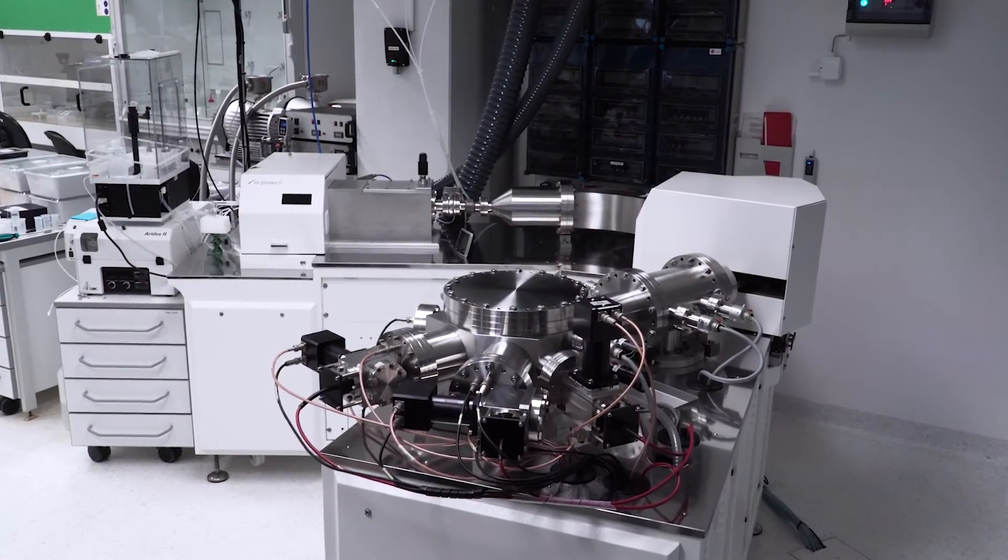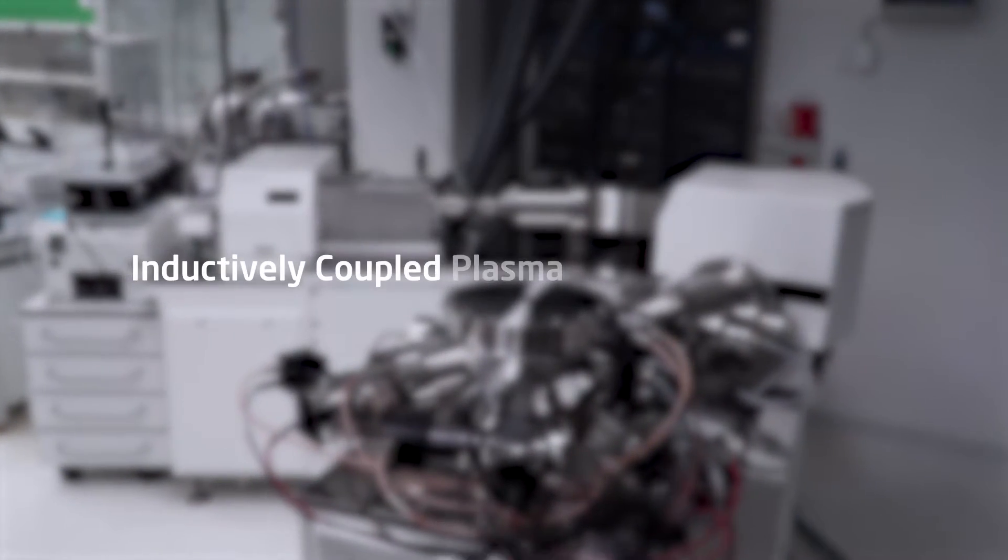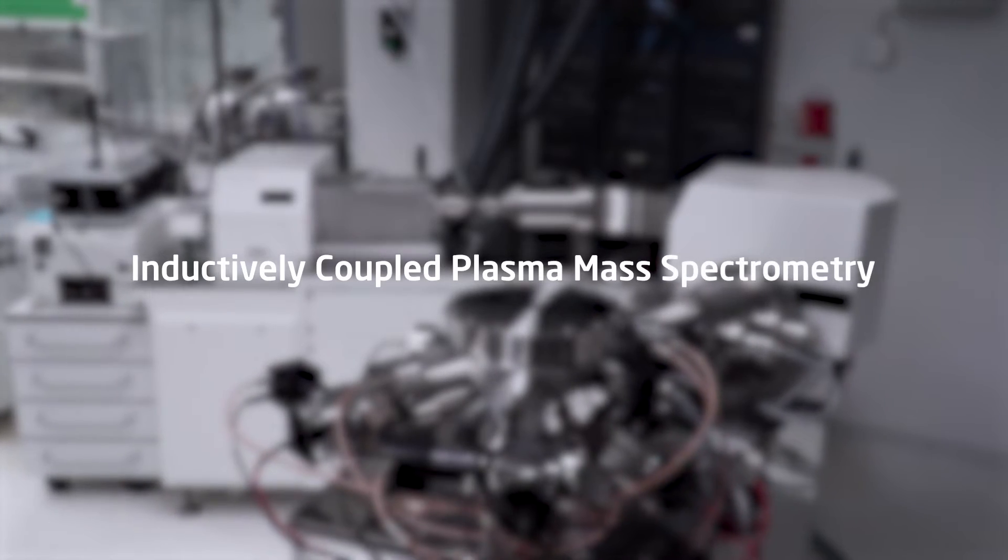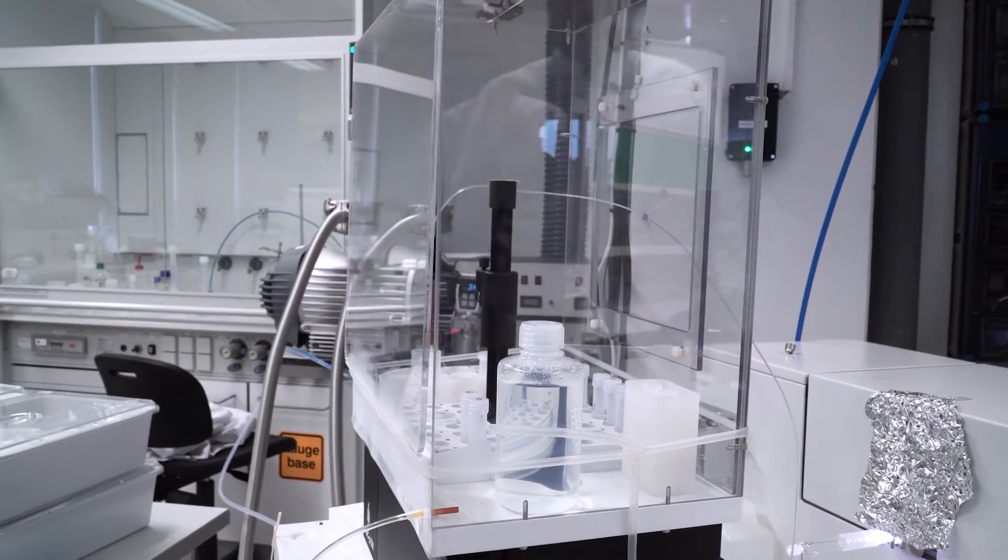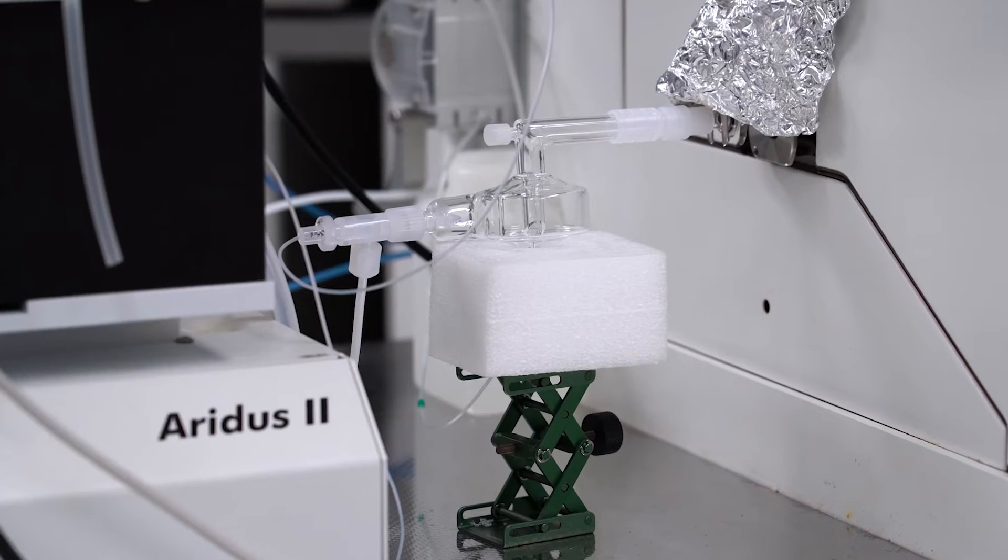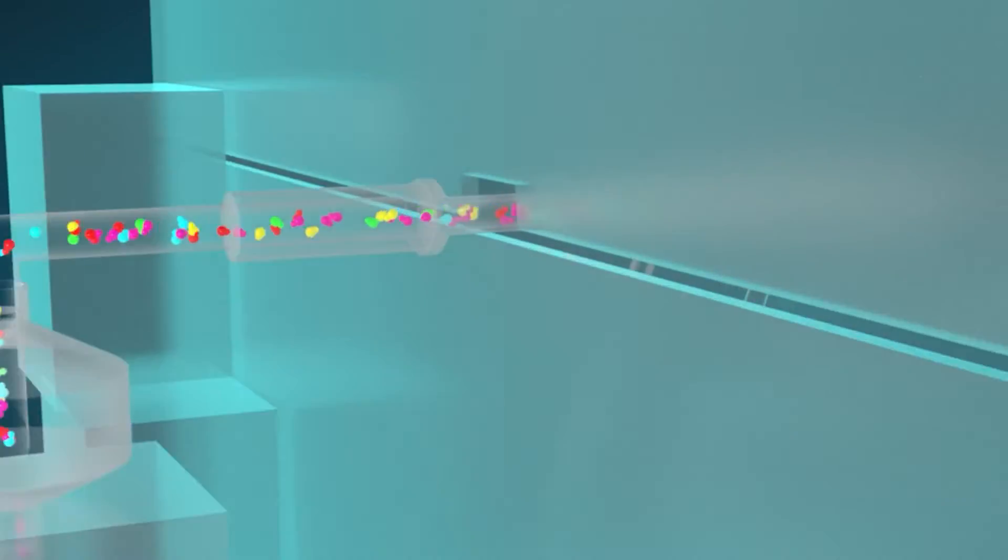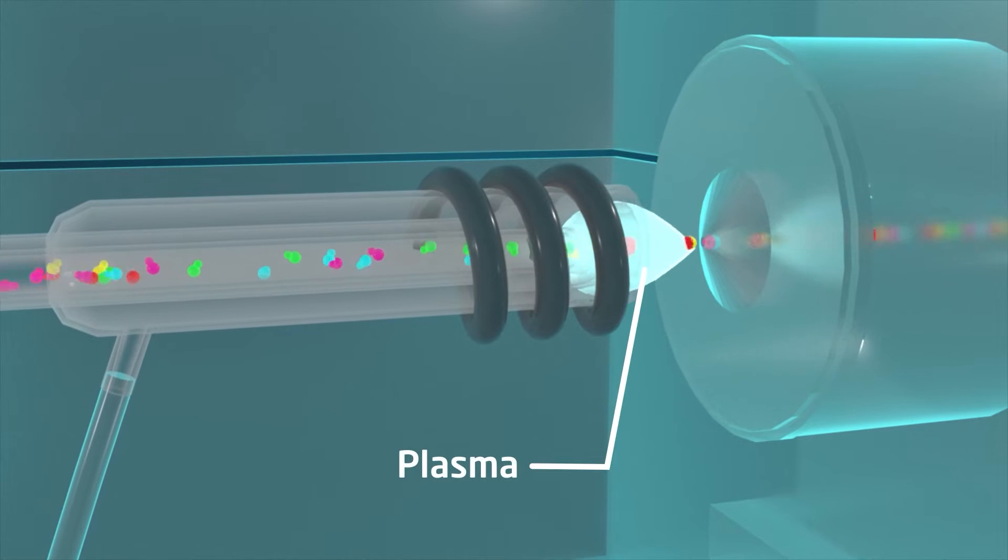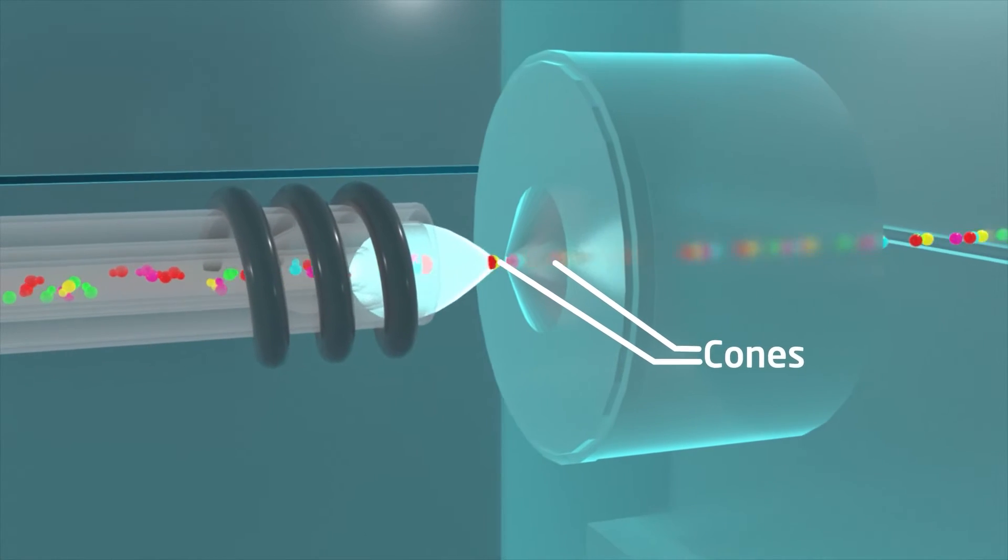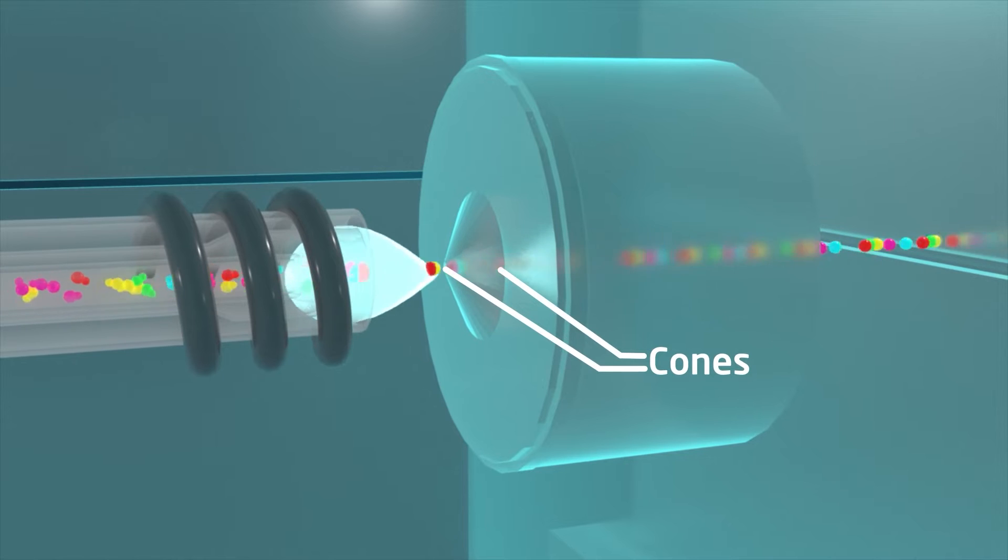ICP-MS stands for inductively coupled plasma mass spectrometry. In ICP-MS, the liquid sample is converted to a very fine spray in a nebulizer. The sample then passes the plasma, which breaks down compounds and strips off electrons from the atoms. Then, it passes through a set of cones that mark the transition to an increasing vacuum.